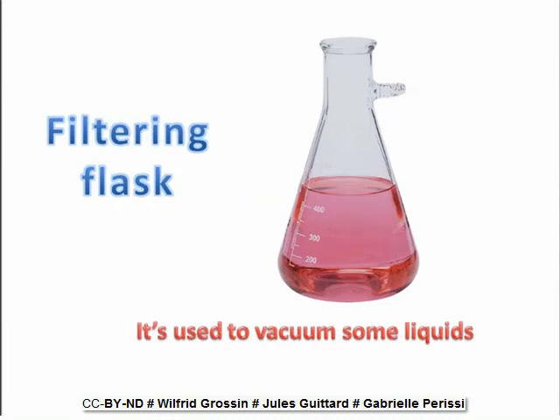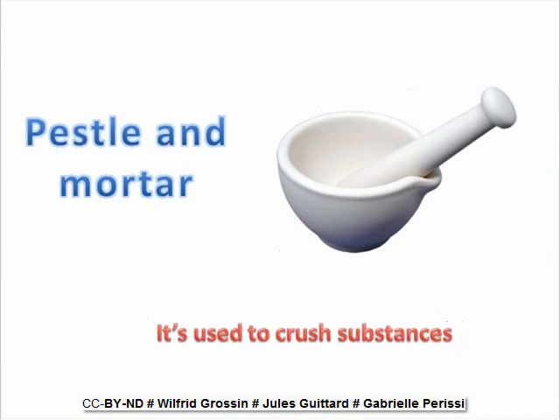Filtering flask. It's used to vacuum some liquids. Pestle and mortar. They're used to crush substances.